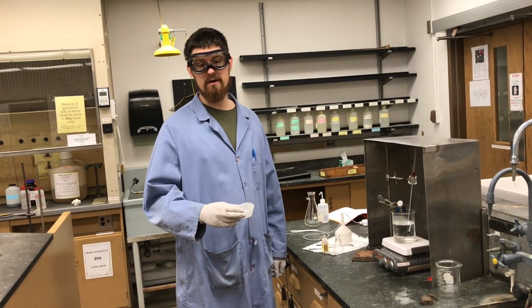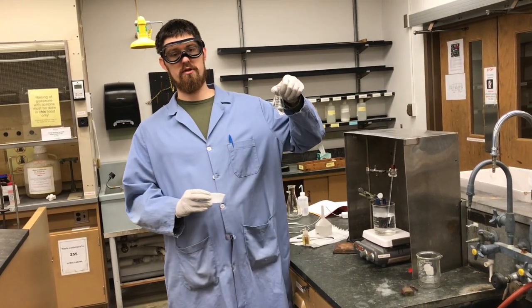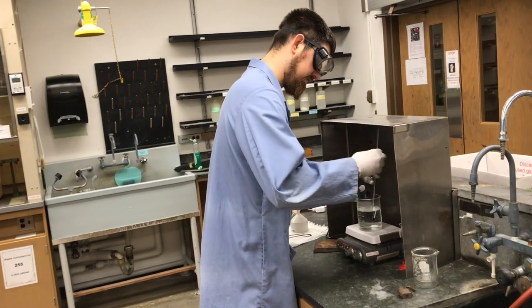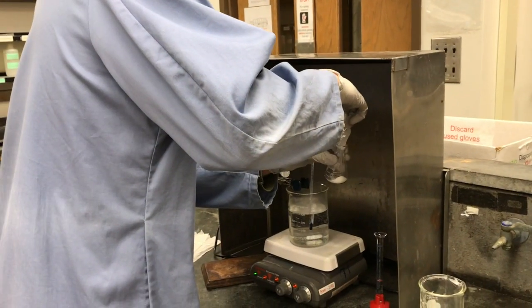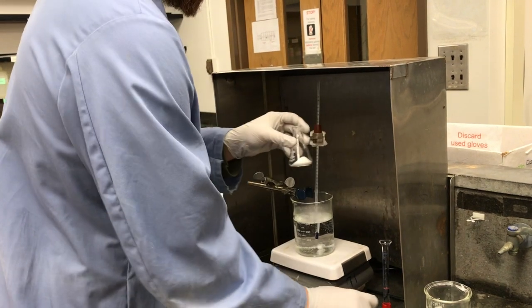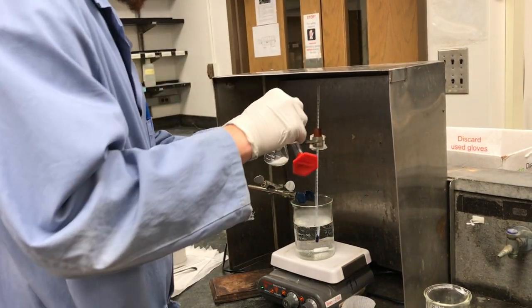So we just weighed out 2 grams of salicylic acid. So I'm going to add that to an Erlenmeyer with a little stir bar. We have our 4 milliliters of acetic anhydride, so we'll add that.